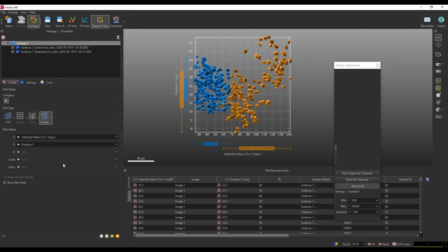If you still have questions, we can help you out with that too. I think we've covered almost everything. Thank you, Daniel, for giving Vantage its due and bringing a lot more eyes to it, hopefully. It's one of the more fun places within Imaris to look at your data and to get an idea of what's going on. So I hope that a lot more people are going to start using it now.